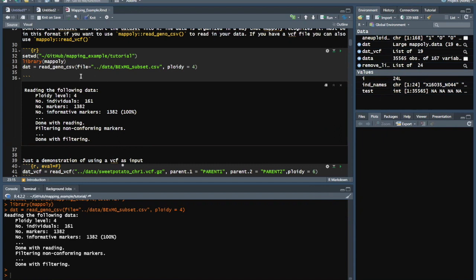All right, so everybody done this first step? Get a thumbs up. All right, all right, all right. Nobody's stuck yet, I don't think. The RMD file is inside of tutorial. Oh, somebody said they're stuck. Oh, there's multiple people that are stuck.